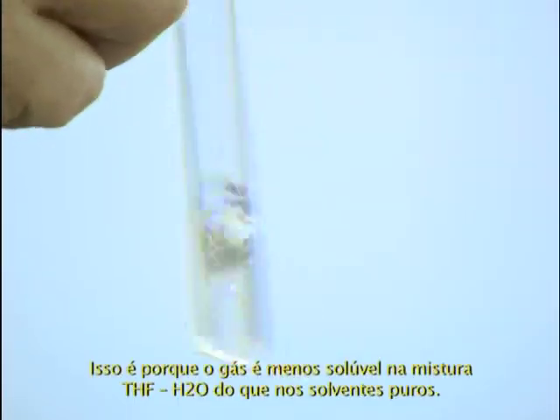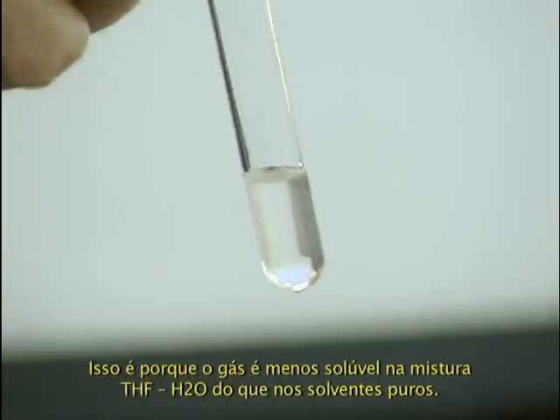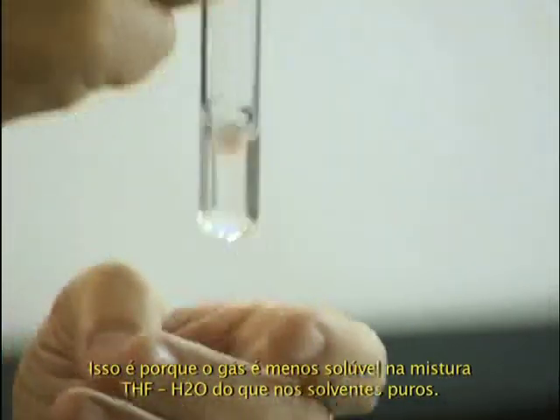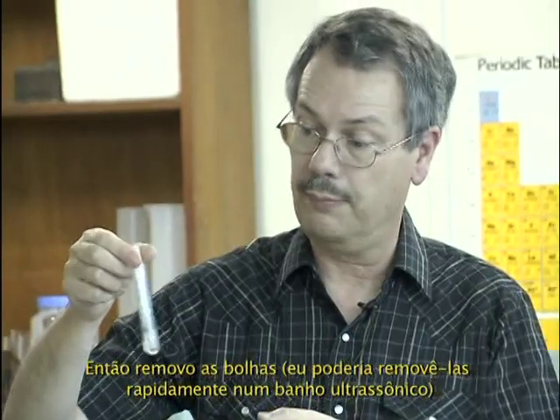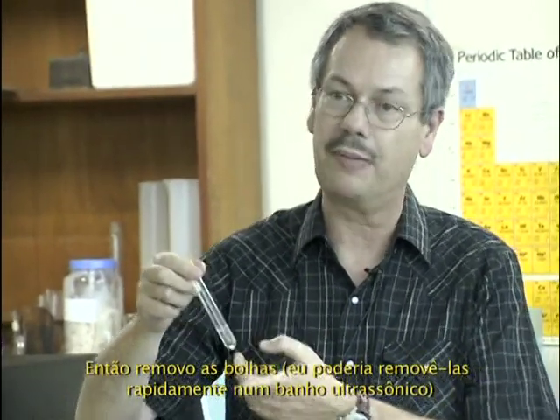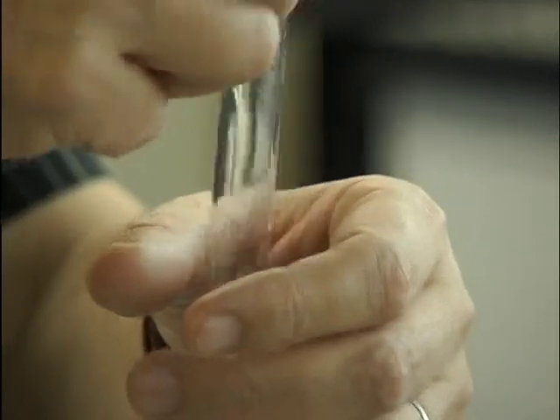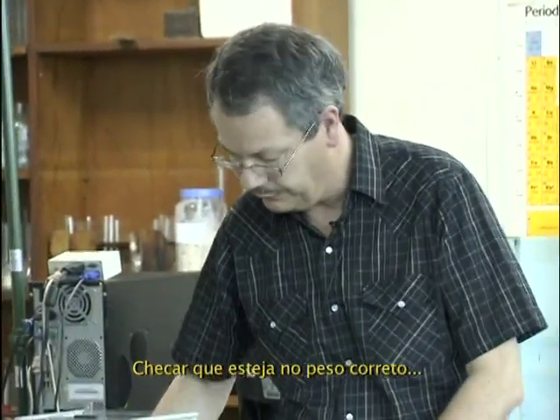So this is due to the fact that the gases are less soluble in the mixture THF-water than in the pure solvents. So I remove those bubbles. I could remove them quickly using an ultrasonic bath, but we will just wait a little bit, check that this stays at the correct weight.